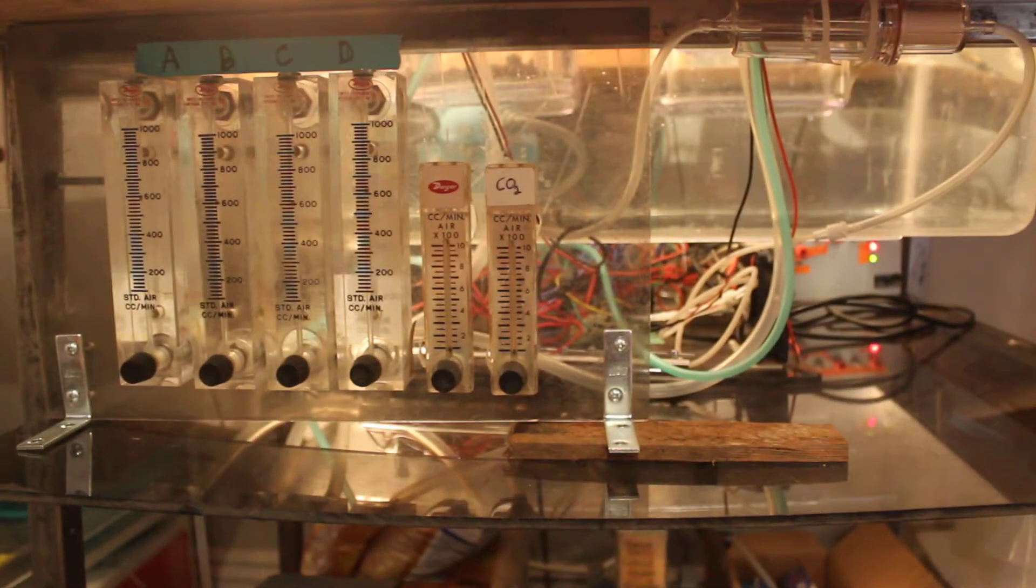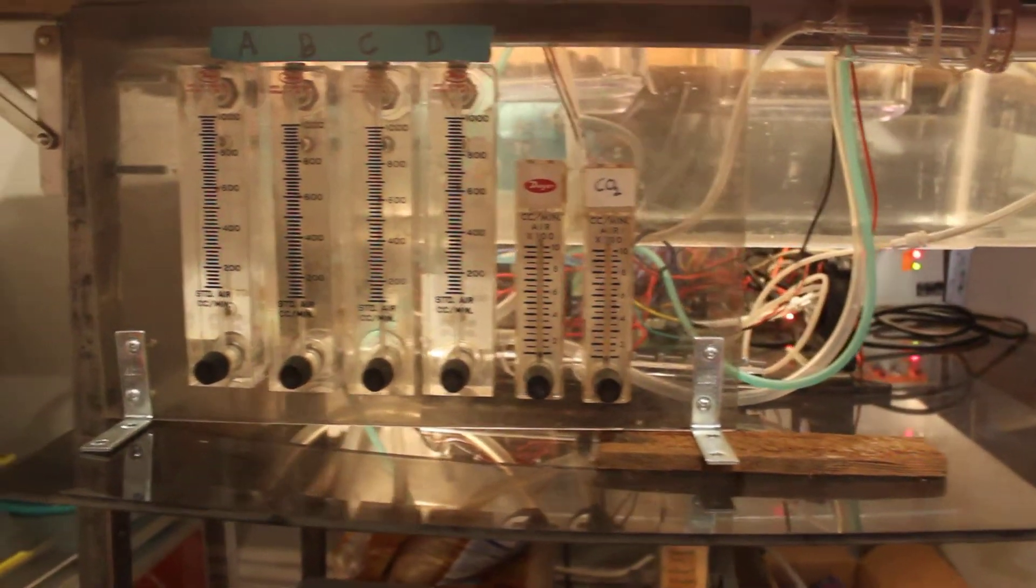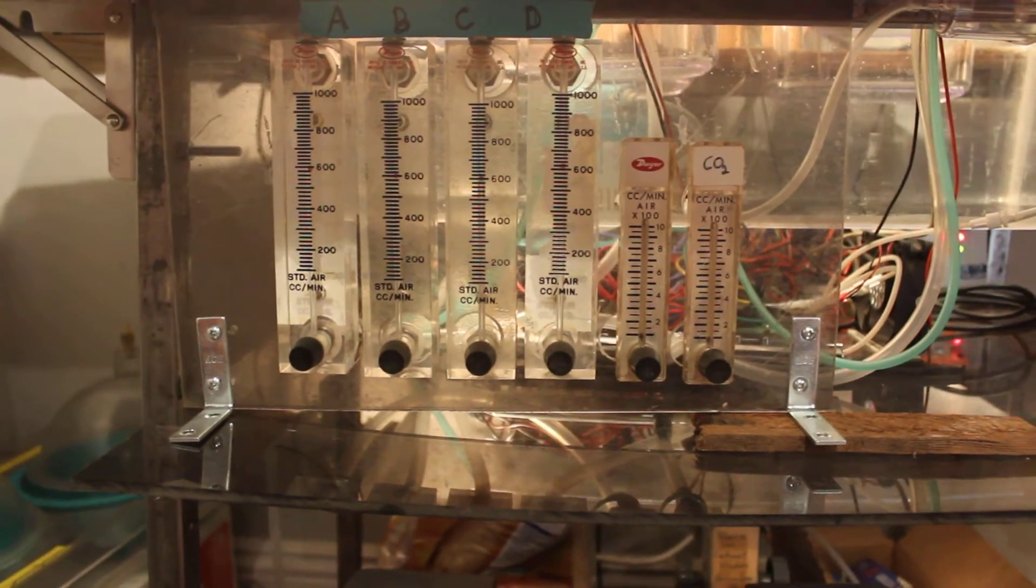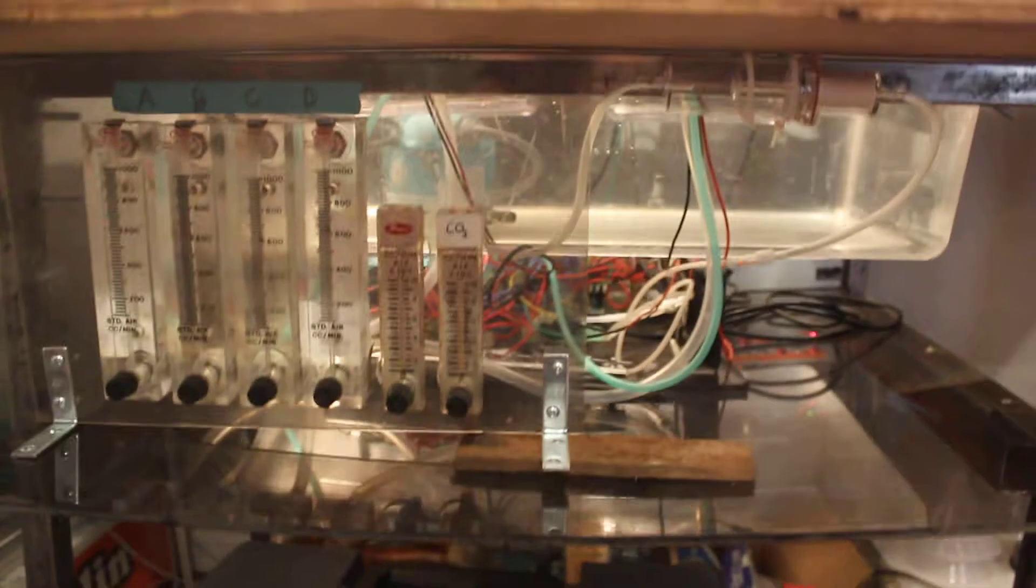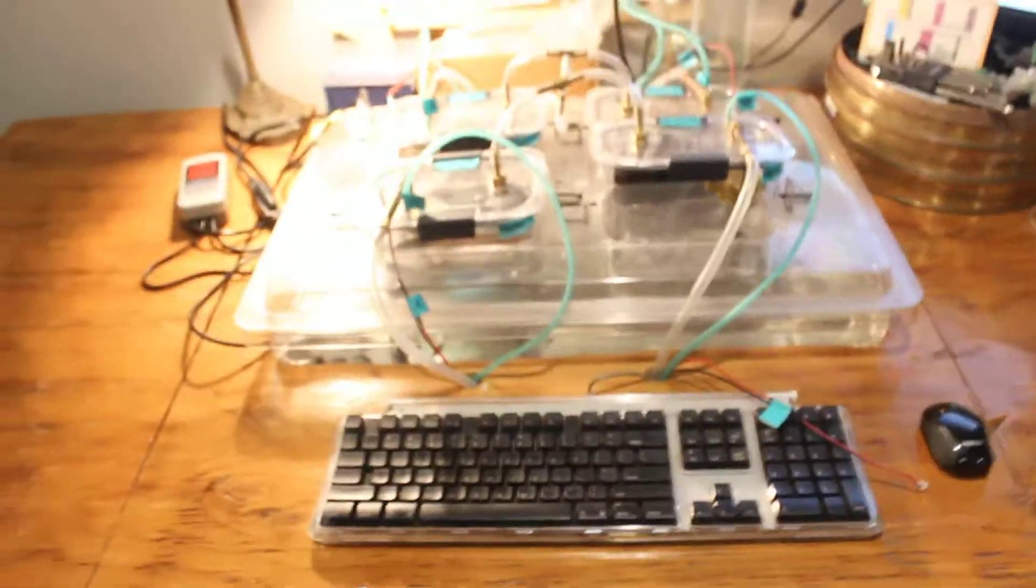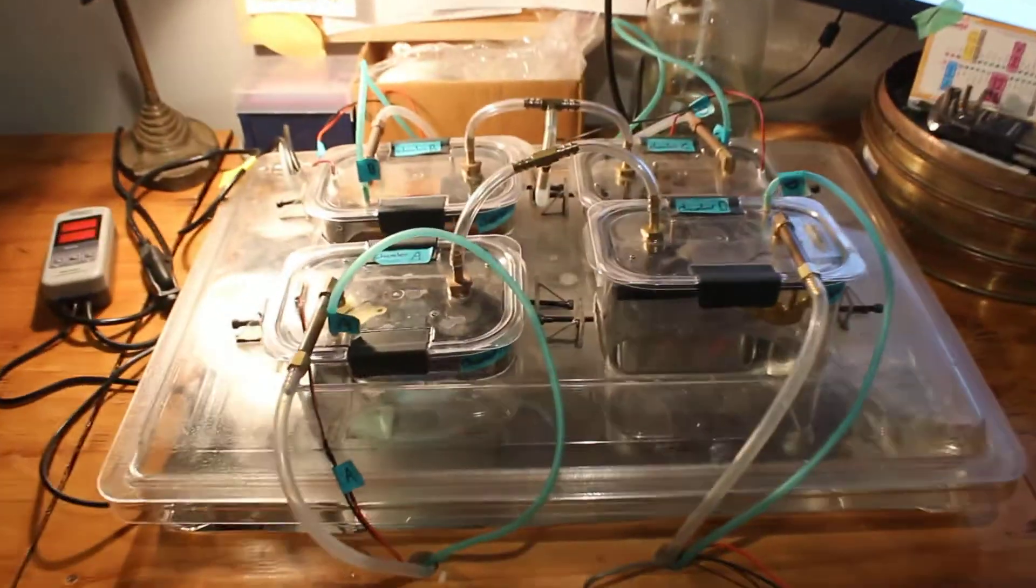So this is just the first look at the incubator. This is going to be the bread and butter of this channel as it will serve to run many soil health experiments. All right, thank you.